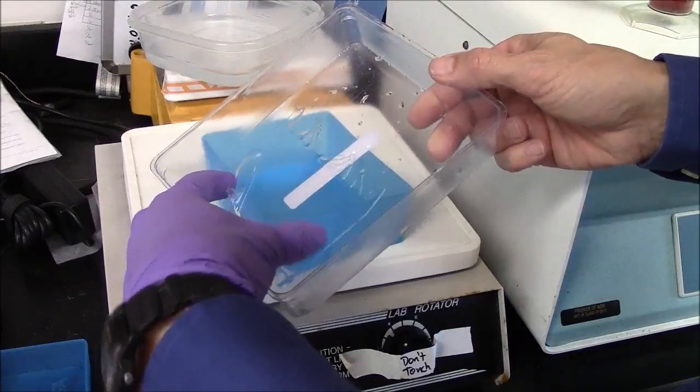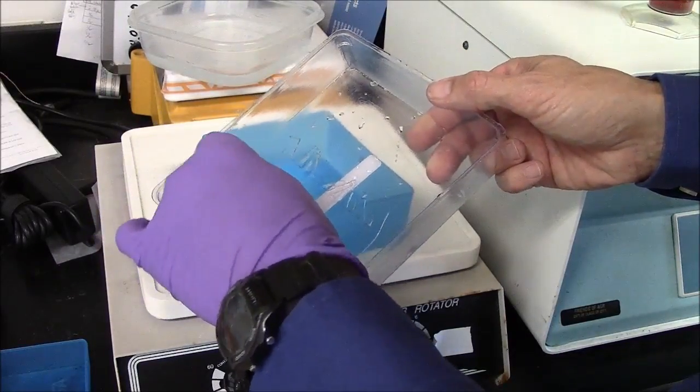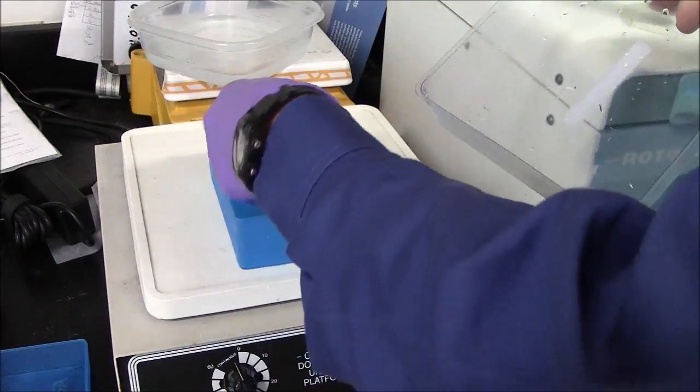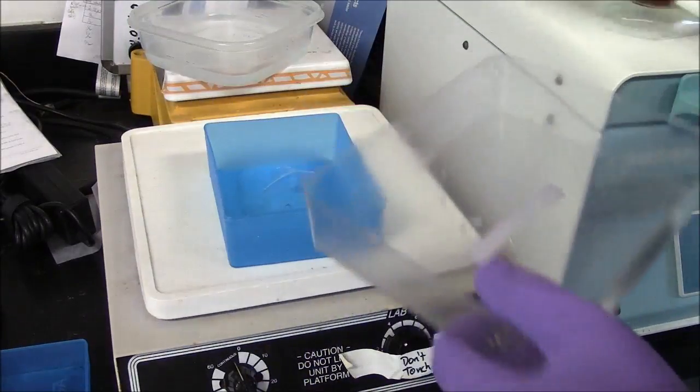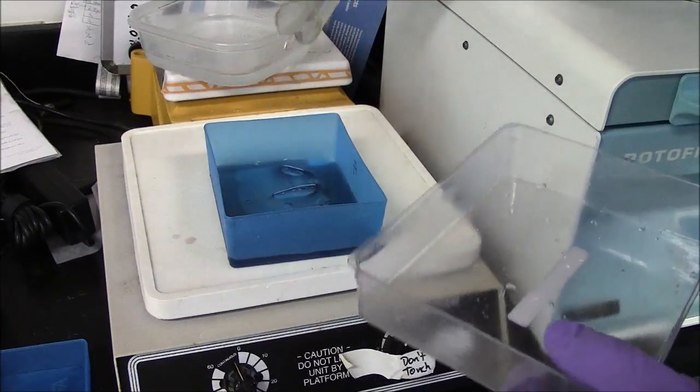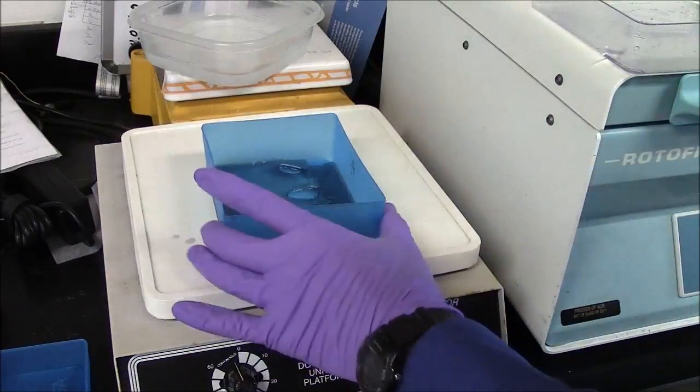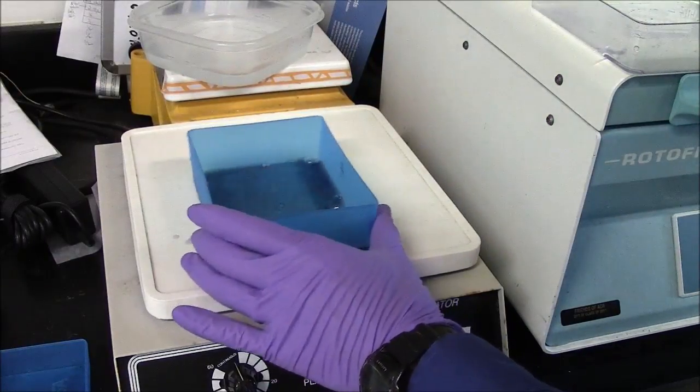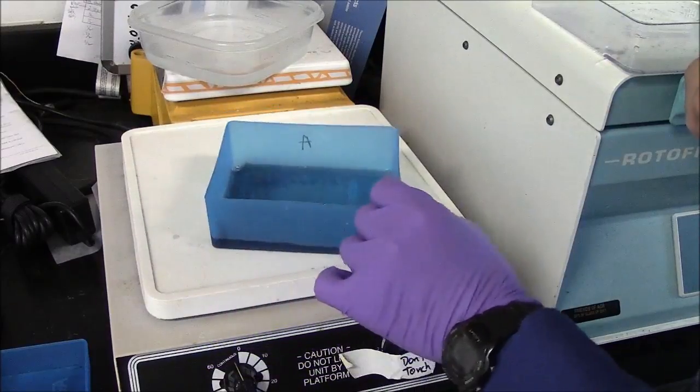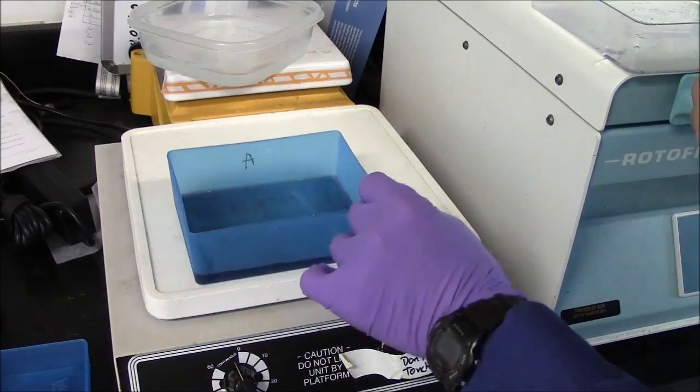I'm attempting to pick up the gel now. It is fragile, but not so fragile that I cannot move it. There we go. Add my stain. So it should be that the gel is covered by the stain and the rocker here, the shaker, will gently agitate that for about an hour.